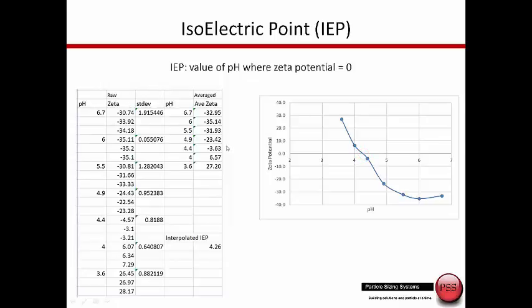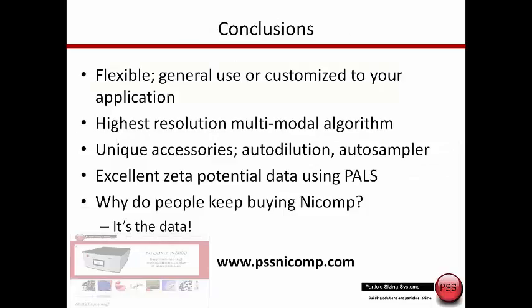And this whole measurement took me not even an hour. So it's a very nice tool for doing isoelectric point tests, which can be useful to determine the surface properties of complex particles. In conclusion, the Nicomp is a very flexible system.